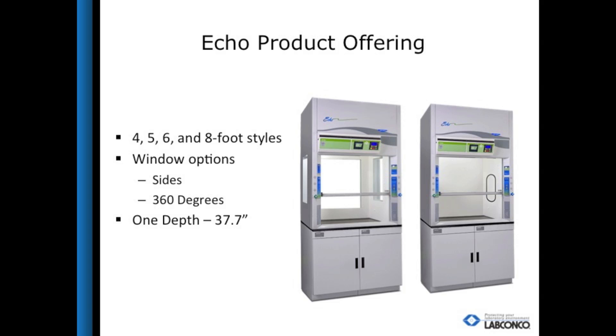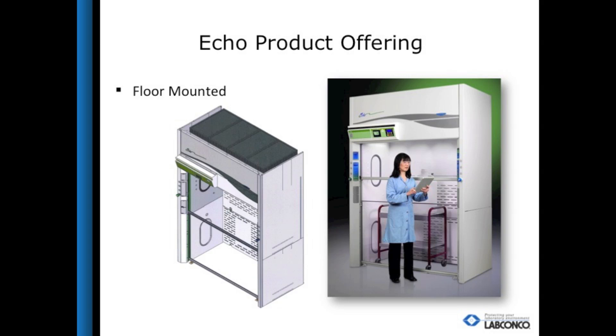The Protector Echo filtered fume hood is available in four, five, six, and eight foot styles, with the option for no windows, just side windows, or windows on the sides and back. Due to the filtration depth it is only offered in 37.7 inches deep to fit a 36-inch work surface. The filter technology uses Neutradyne filtration by Erlab, a comprehensive carbon filter that effectively filters acids, bases, and solvents, taking the guesswork out of choosing a filter type. LabConco also offers a floor-mounted version of the filtered fume hood to assist with applications when it is impossible to duct to your floor-mounted hood location, allowing for applications with large equipment or carts without requiring any makeup air or vent connected to the outside.